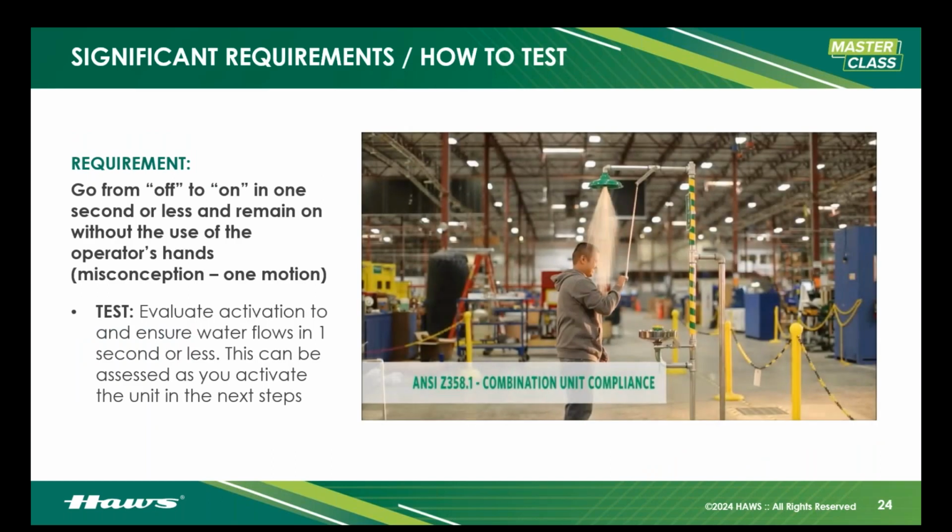Now I'm going to show you an example of my coworker here. That's McDean. That water is not tepid. And you can see him after he activates the shower go, woo, because that is cold. But that equipment has to go, you'll see as he activates it, he's hitting the paddle, he's pulling the pull rod, it's going off to on in 1 second or less, very quickly, okay? You can't have a further delay in activation or an additional time added there. It has to be quick.